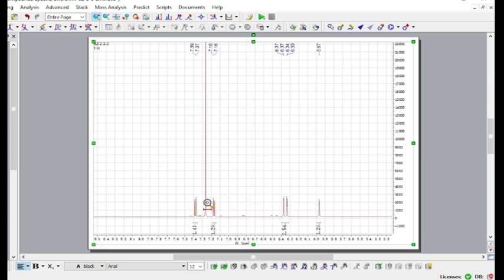All right. Another prominent signal that you see in the molecule, most of them or some of them, are the aromatic protons. So you can assume that this signal present here around 5.97 ppm is an aromatic proton or an olefinic proton, and it's a single proton. So you can set it to 1 and everything else is set accordingly by the software itself. So this is how you can set integrals for your molecule.